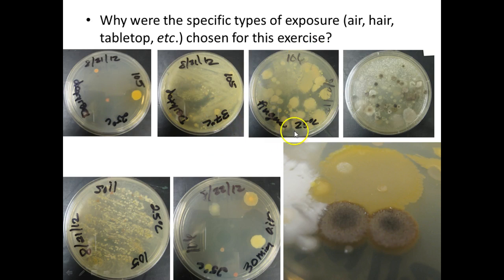Here's the whole class fingers. Look at that. And that was only at 25 degrees. Look at how much growth is on that plate. Look at the soil one. Look at our air one. And look at this fuzzy stuff. Is that bacteria? It's fungi. It's mold, right? It's mold. It's going to be fuzzy like that.